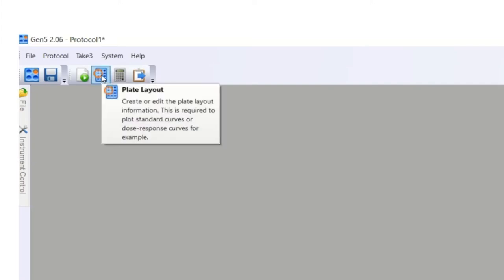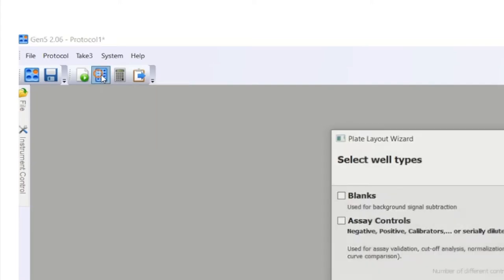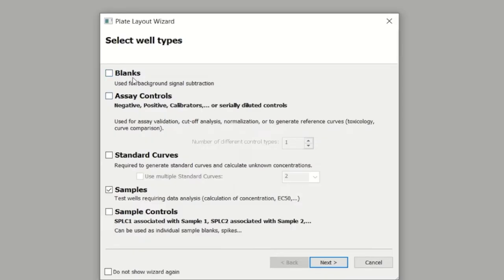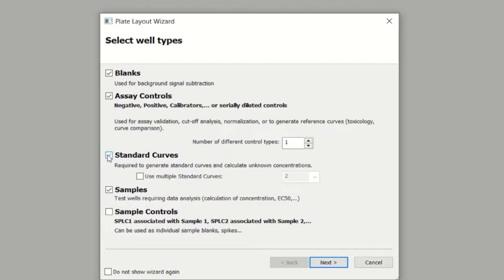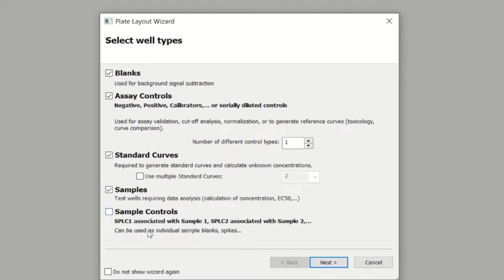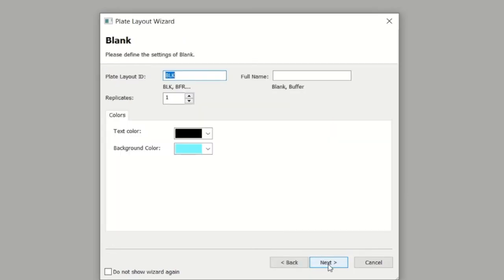I'm going to go ahead and do the plate layout now. Here's where you tell the software where your blanks are if you're going to have blanks, where your assay controls are if you're going to have assay controls, where your standard curves are, which you will have if you're doing a quantitative assay, where your samples are, and if you have any sample controls as well. I'm actually going to select all of these, but if you don't have a blank or a sample control or a negative or positive control, you could just not select those options.